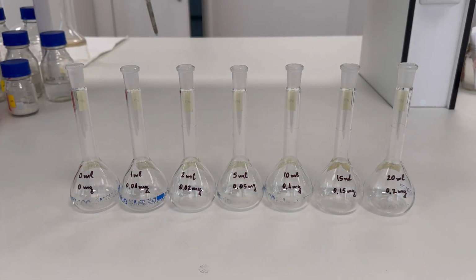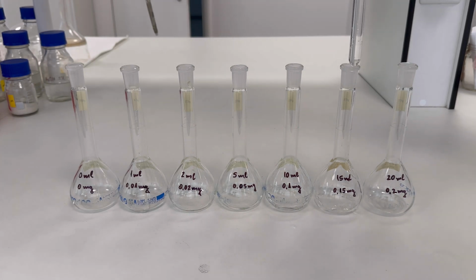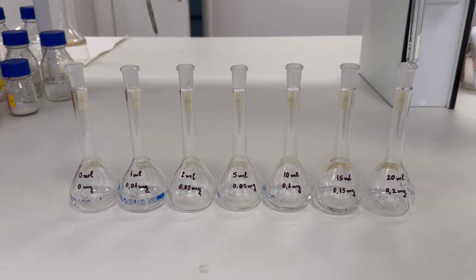For the next step, we will need 7 volumetric flasks of 100 milliliters. The first one will serve as a blank, while in the others we pipette the corresponding volumes of the standard solution C. This would be 1 milliliter, 2 milliliters, 5 milliliters, 10 milliliters, 15 milliliters, and 20 milliliters.